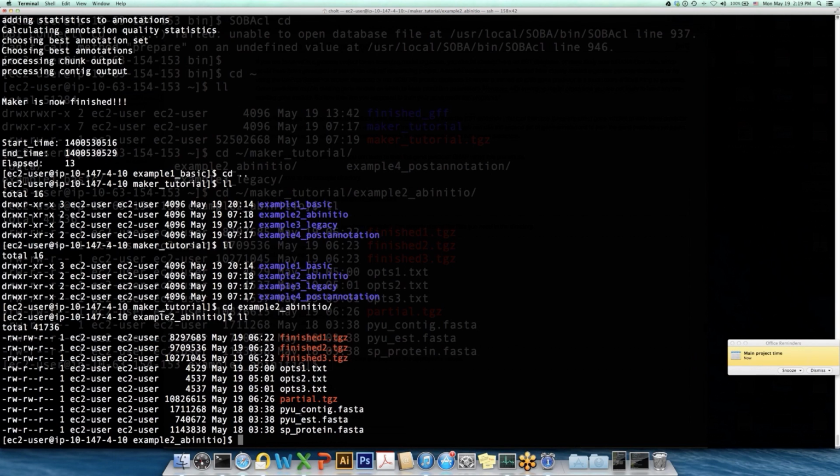We're going to use an input genome config. It's about 1.7 megabases in length. It has to be pretty big because we have to have enough genes to train with, which normally means Maker's going to run slow. So I'm going to have everyone at least pre-fill out some of the data to make Maker run in a normal time. Here's the EST data, and here's some protein data we're going to use from multiple species. This is from a genome called Pythium ultimum. It's an oomycete. It's not a fungus, but its gene structure is very similar to fungi. Very long exons, short introns, and high gene density. So even in a very short 2 megabase region, we're going to have a lot of genes.